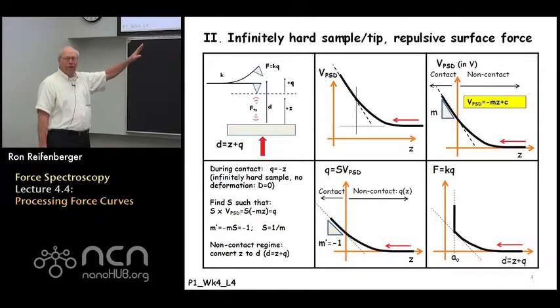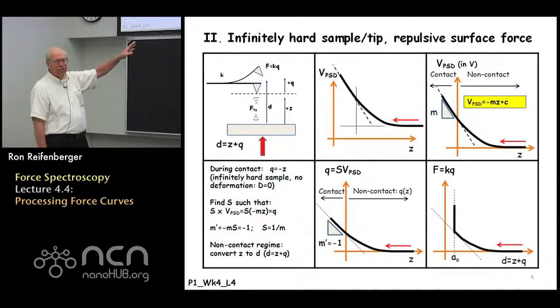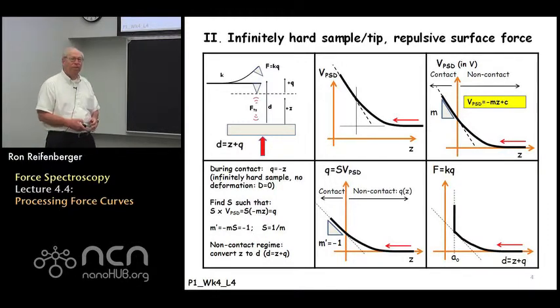Again, the parameter A0 is completely adjustable. It's a number that you can set. Very often, A0 is set to 0, which basically means that the curve is shifted a little bit to the left. Those are just personal preferences. Different groups and different manuscripts have different conventions that they follow. So you just have to understand the convention that's being used and sort your way through it.